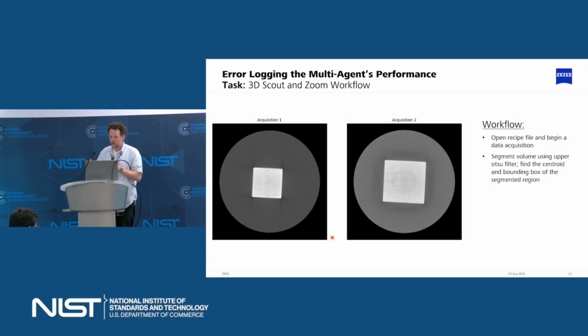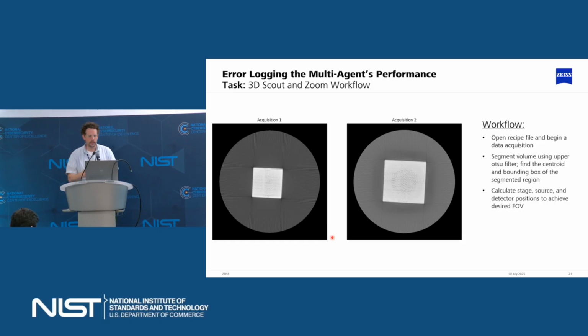And then we're going to check, okay, did it move to the right magnification.